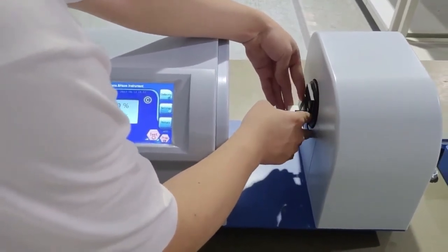Click History to check the data records. The data can be exported using the USB stick. Click Test Completed, then check the data as needed.